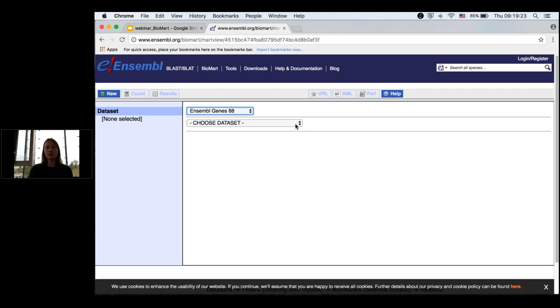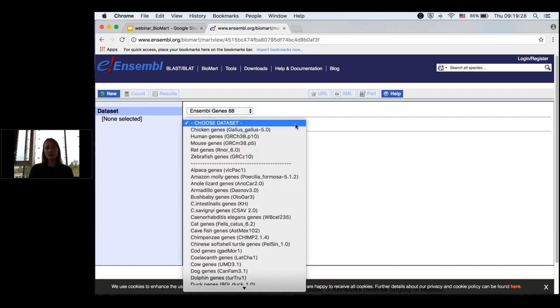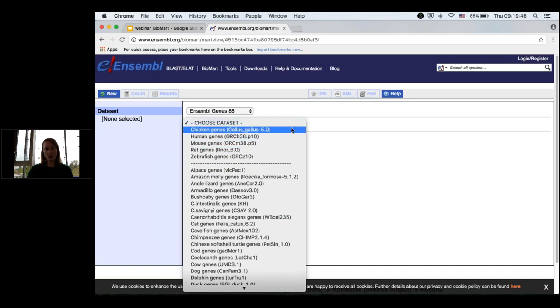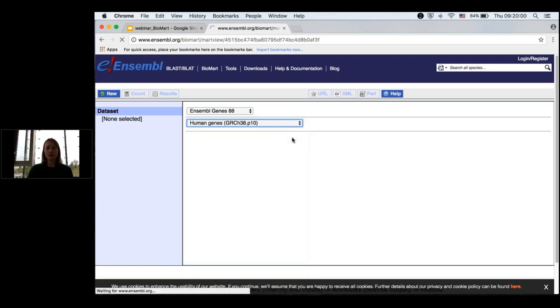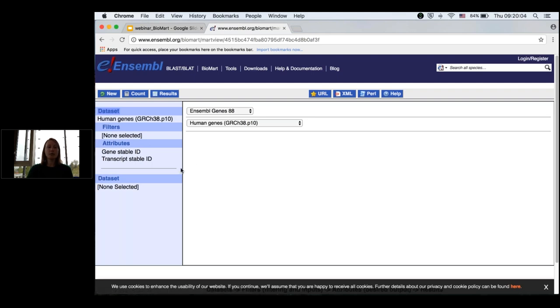Next we're prompted to select our species of interest. You can see a list of all the species that have reference genome assemblies in Ensembl, with the particular assembly version shown next to each species name. The most-searched species appear at the top, followed by the full list. We're interested in human, so I'll select that. Now that I've selected it, I'm being prompted to choose my filters and attributes, and a couple of attributes are already predefined by BioMart.